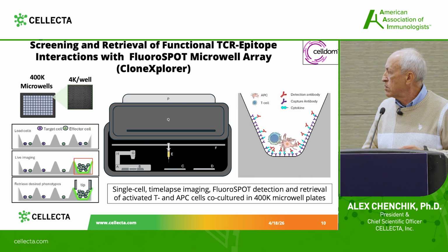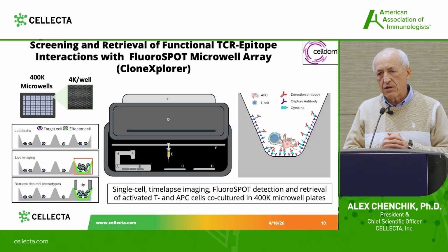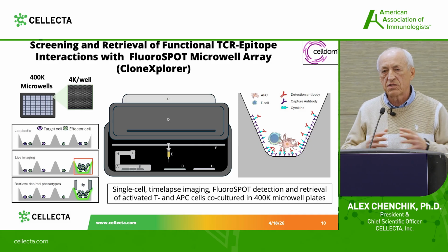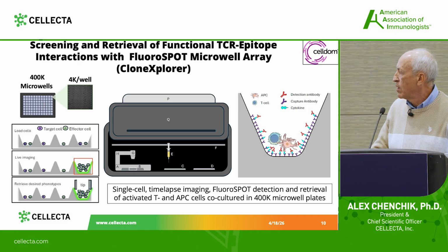You use these plates to incubate in this instrument. It allows recording everything over time, and you can grow cells in this instrument without removing the plate for up to 2 weeks, because at the same time it's a small CO2 incubator with temperature control. And it also has deep fluorescent imaging.